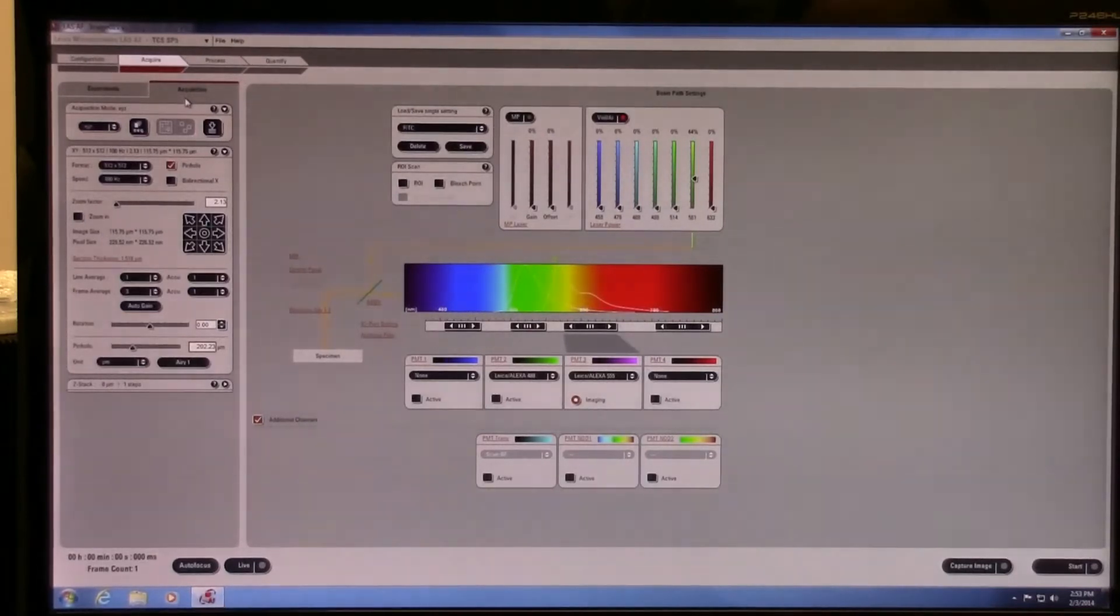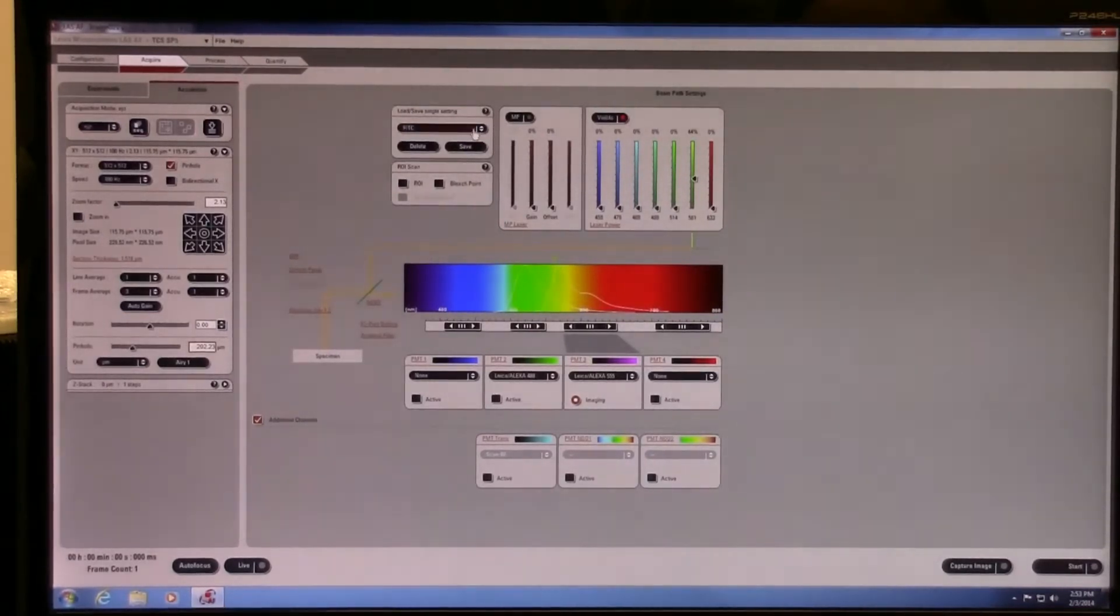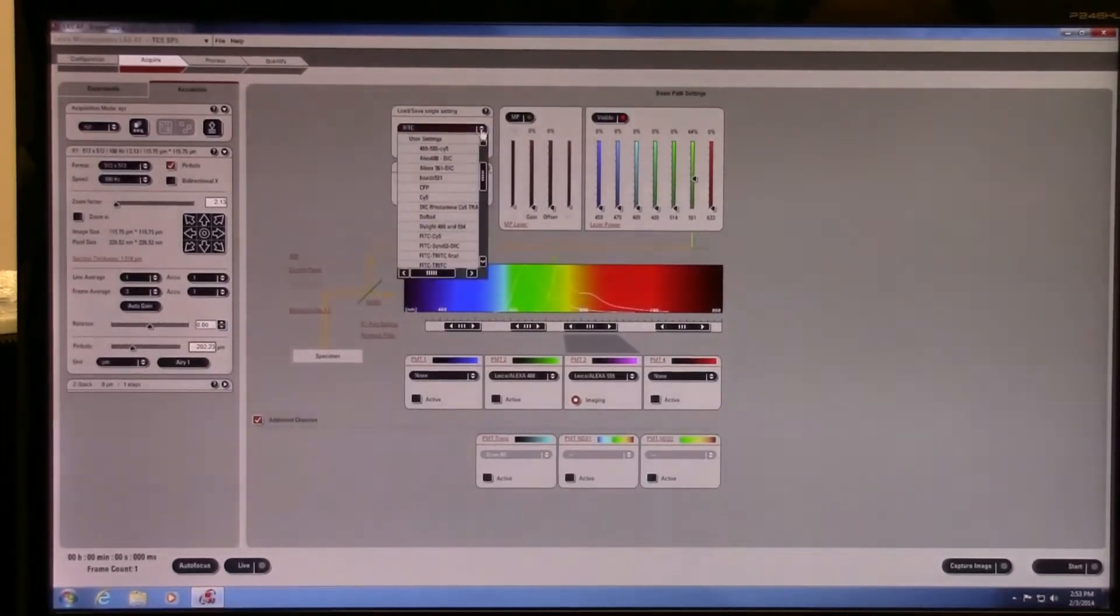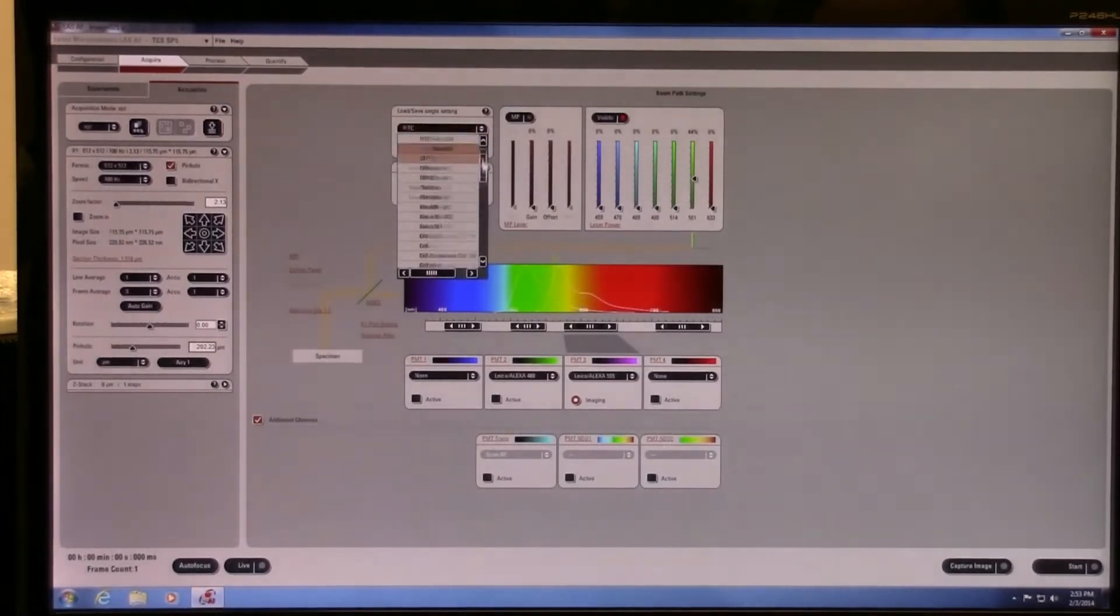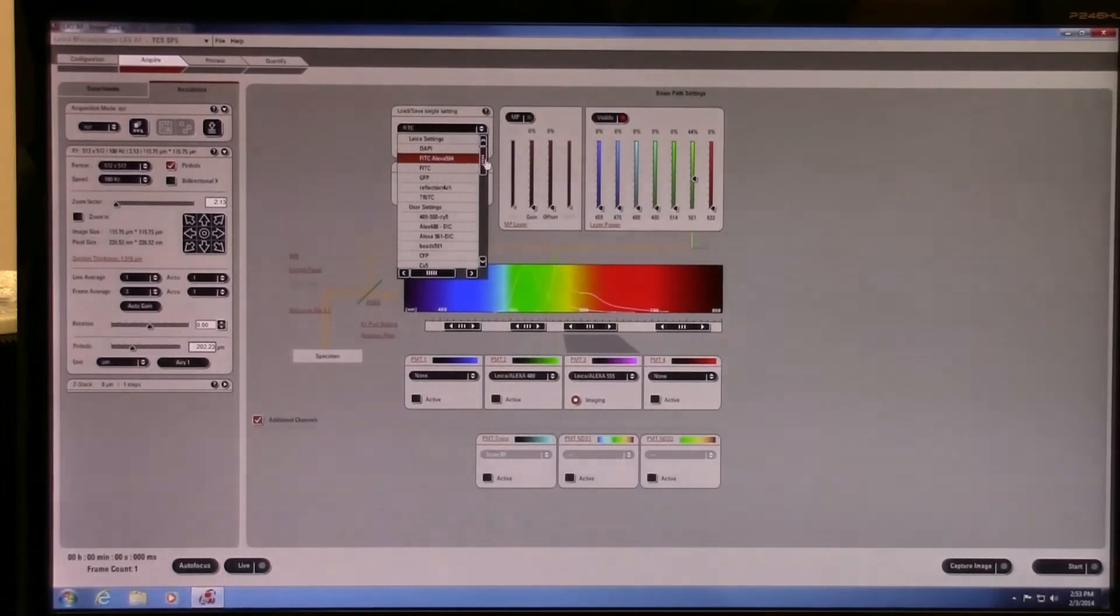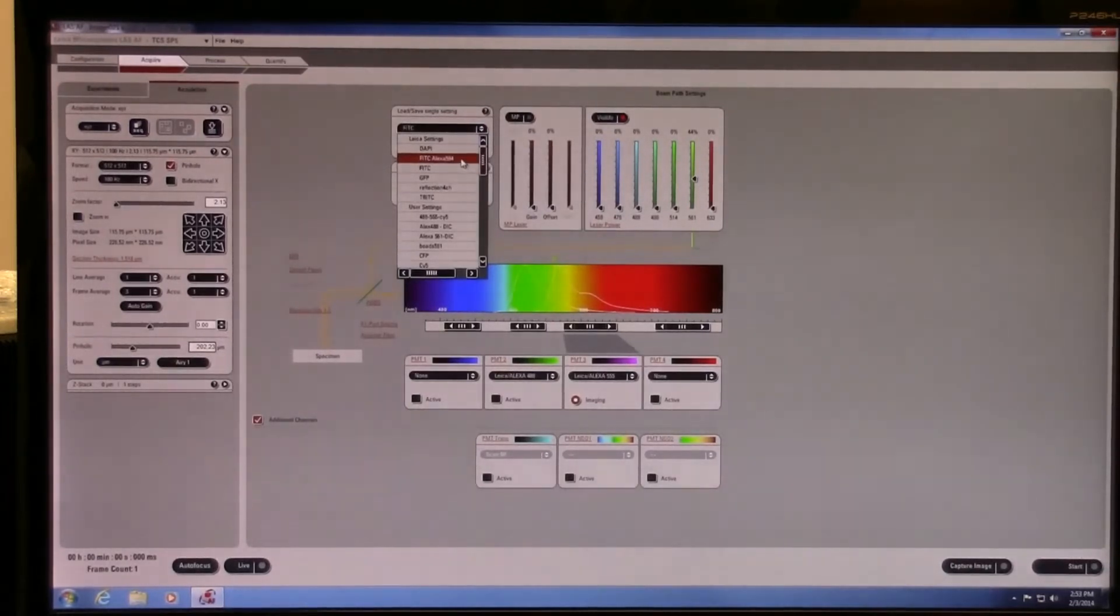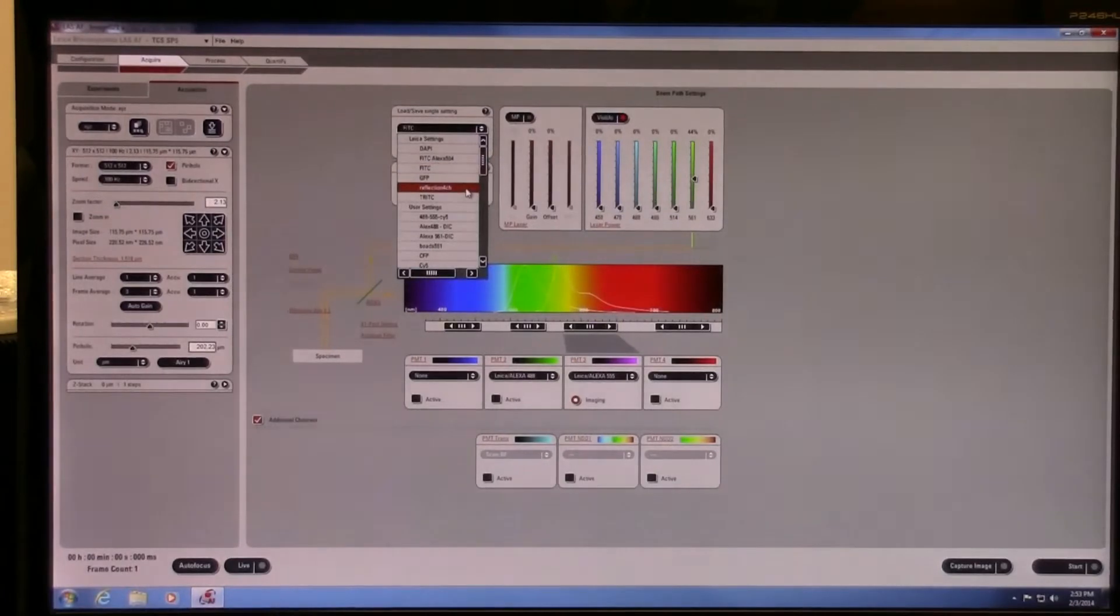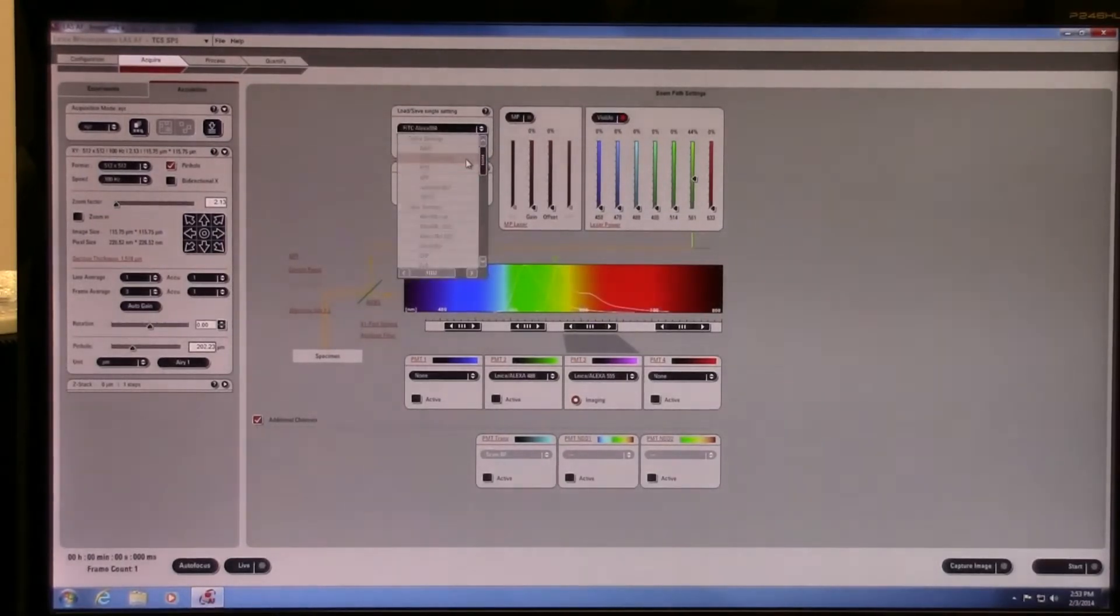To start with, we're going to choose from a multi-channel setting. There's plenty of those available here, but custom ones can be made. I'm going to choose a two-color image. In this case, I'm interested in FITC and Alexa 594.